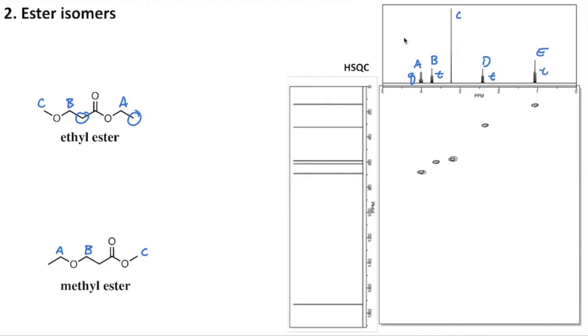So E is also a triplet, but our knowledge of the carbonyl chemistry of that really electropositive carbon center pulling away at that adjacent alpha carbon makes me pretty confident that we can say the alpha carbon to our carbonyl here is D, and that methyl group, the furthest upfield, not really very close to anything interesting, is going to be E. So again, we can transfer those same assignments onto the methyl ester down at the bottom.